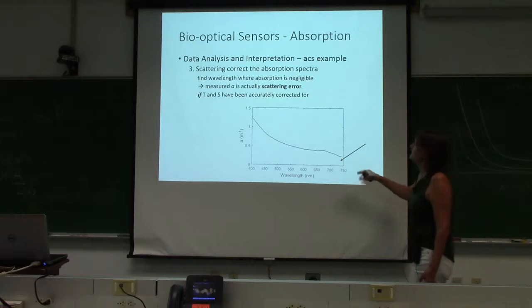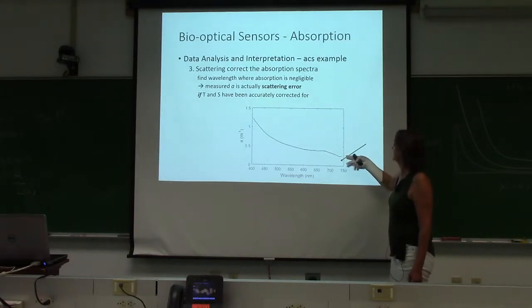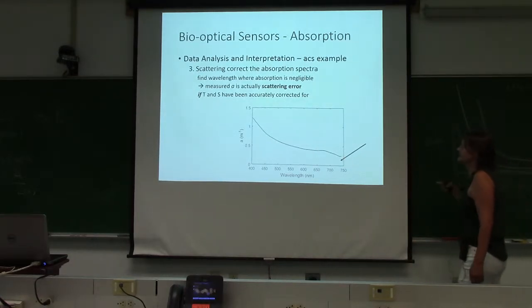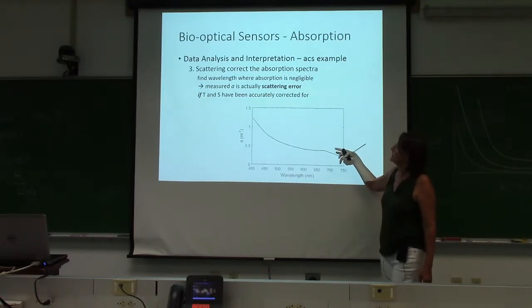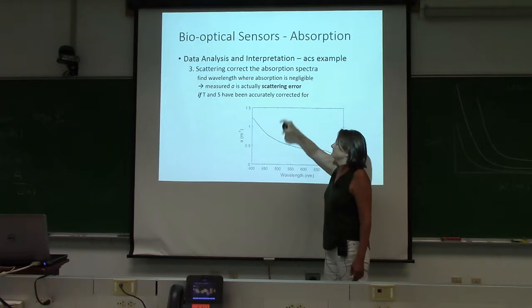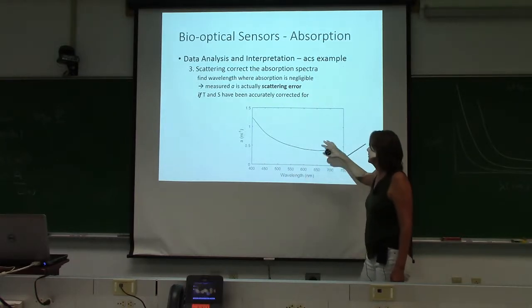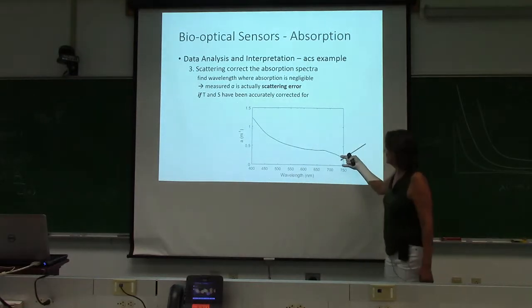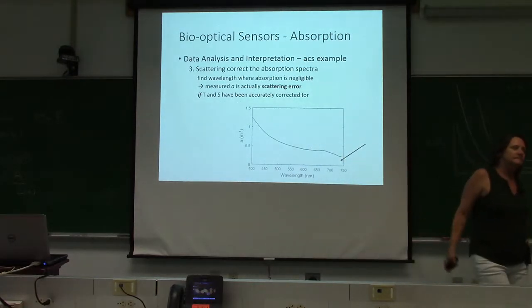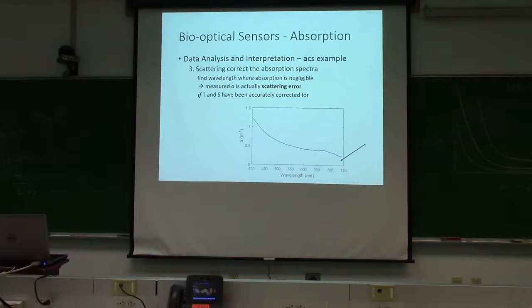So then the question is, what do you do about the scattering? What is this signal? That gets back to here. What is that signal here? We know that there is a scattering error in A. And if we've correctly done our temperature salinity correction and we still get an offset here, what's that signal? What do we do with it?